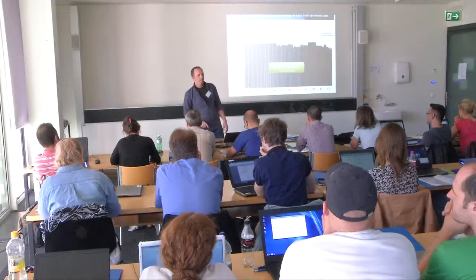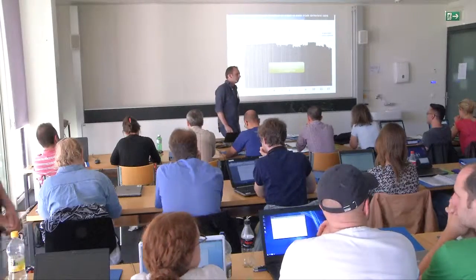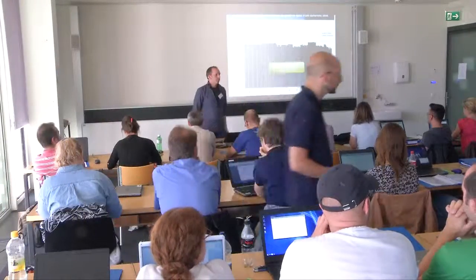So in general, and it's not only for collision energy but other parameters, you want to try to get things as similar as possible, and this is the most effective way to get this targeted analysis and scoring to work. A bit more on this tomorrow.